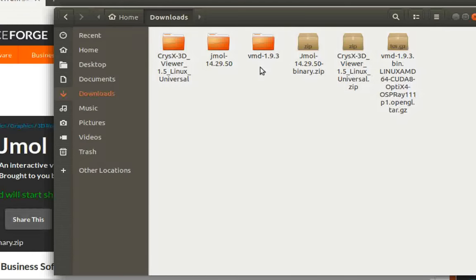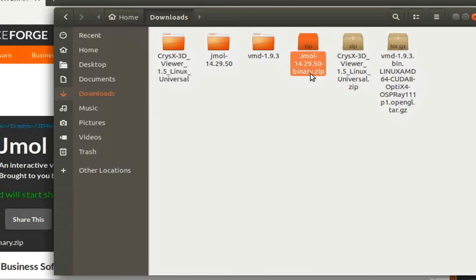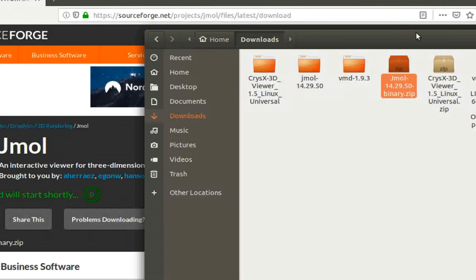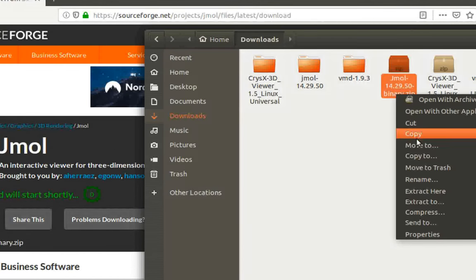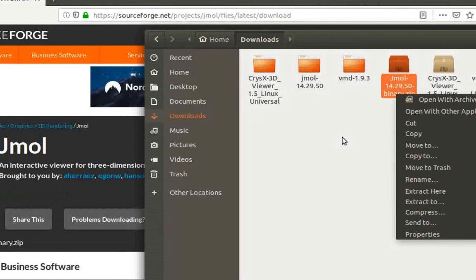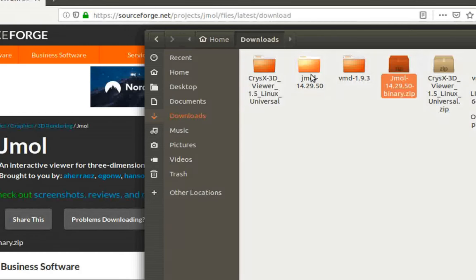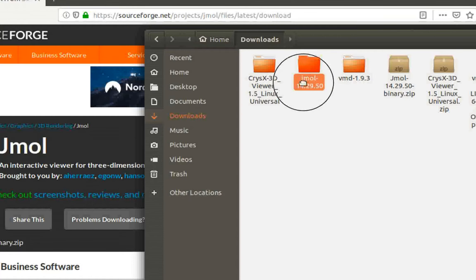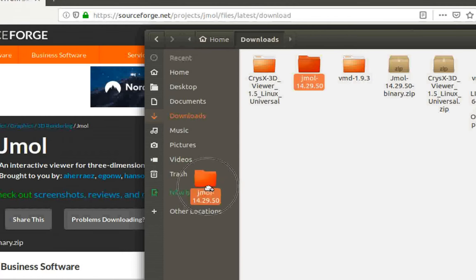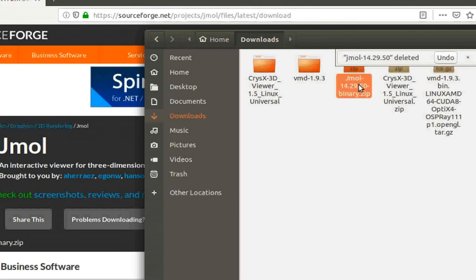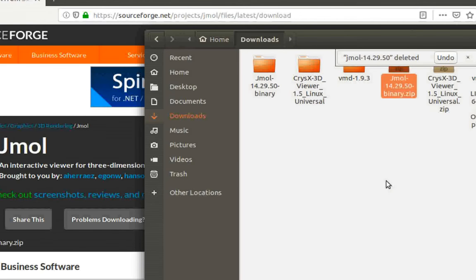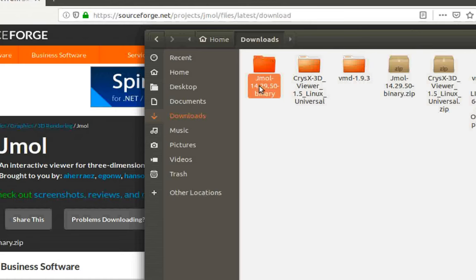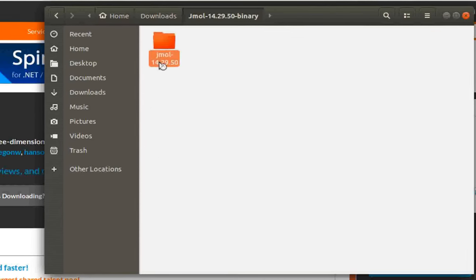This is the Jmol binary zip package that we downloaded. You'll go ahead and right-click on it and click extract here to get this directory. I'll show you once again by deleting it, then we'll right-click on the downloaded zip package and click extract here.